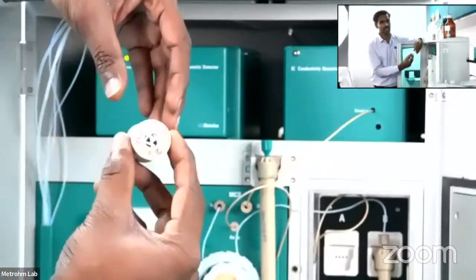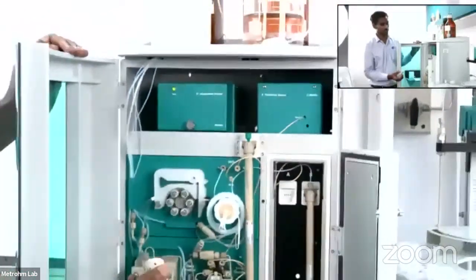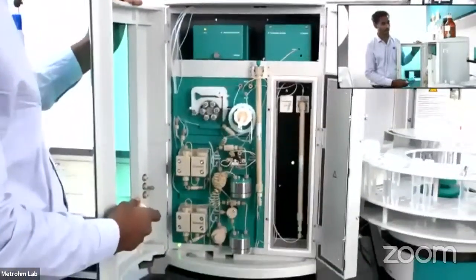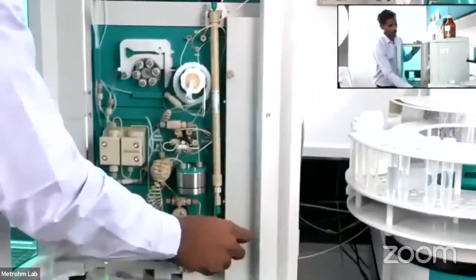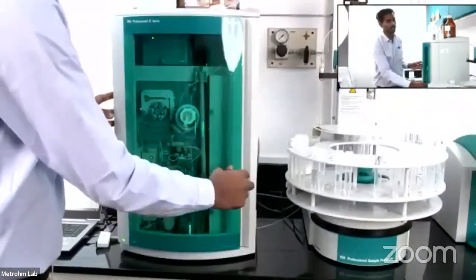So everything is a simultaneous process. It is controlled by the software. Okay. Once everything is done, it goes to the conductivity detector. Okay. So this is the flow path of the ion chromatography instrument. And I will show the autosampler part, how the sample is injected into the ion chromatography system.